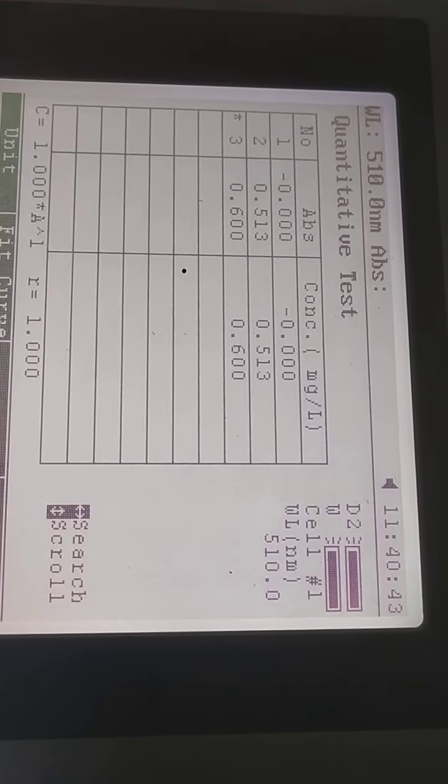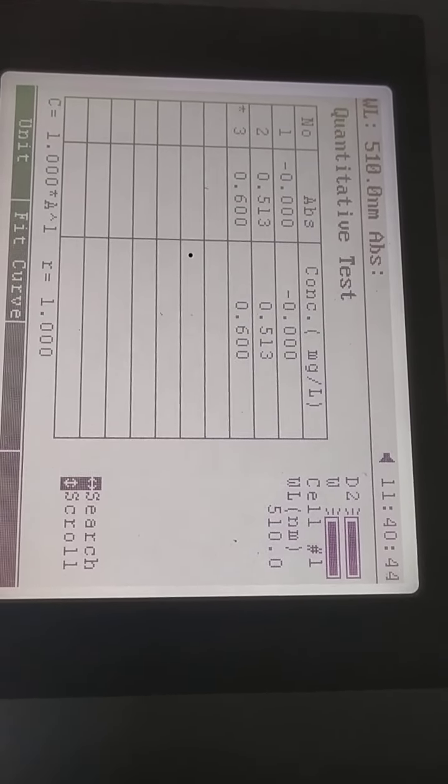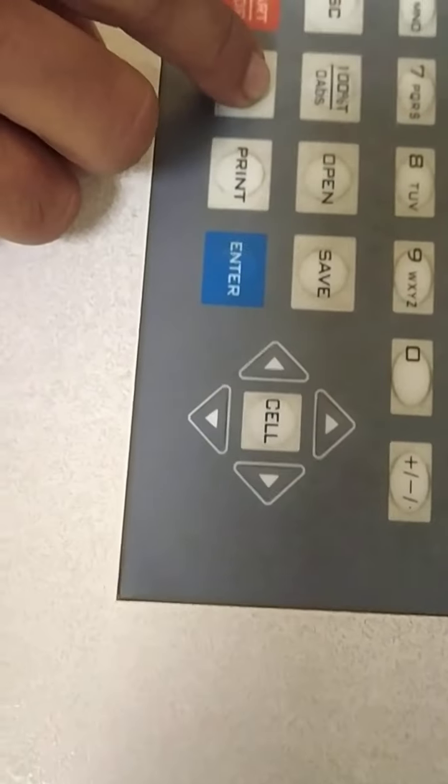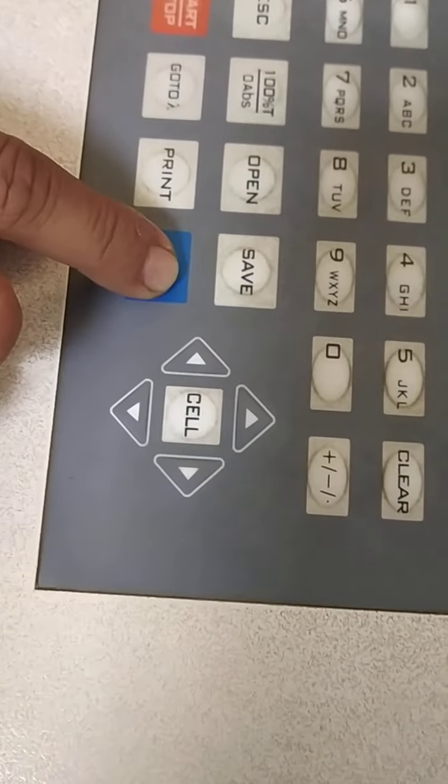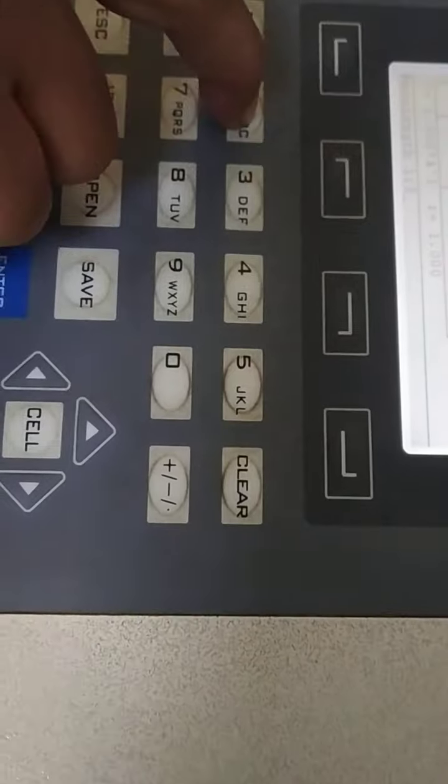Now further we want to change our wavelength — go to the lambda, single wavelength 520.